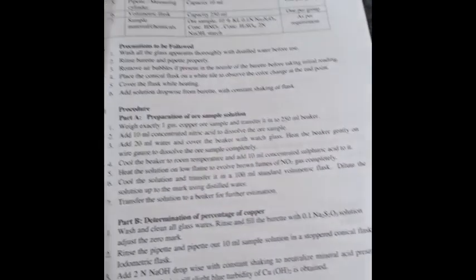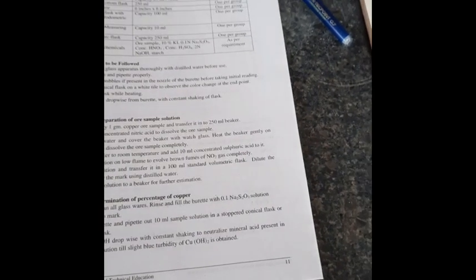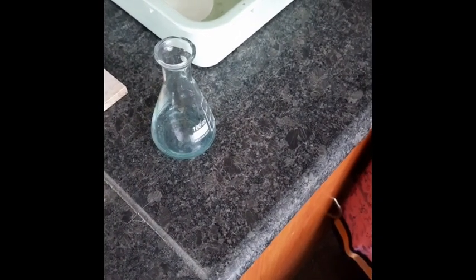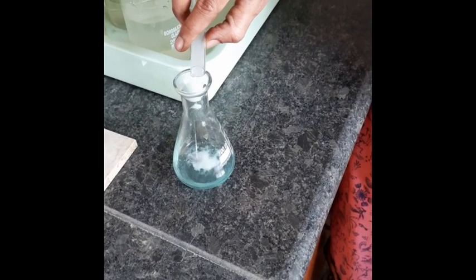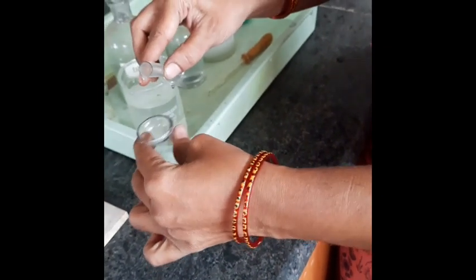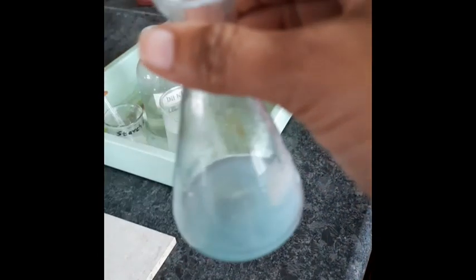Next, after the 10 ml sample solution, you have to add 2 normal NaOH dropwise with constant stirring. See here, this is the NaOH. Now I am going to add the 2 normal NaOH in the same conical flask. Add it with continuous shaking till you get the blue precipitate. See, blue turbidity is obtained at the bottom.